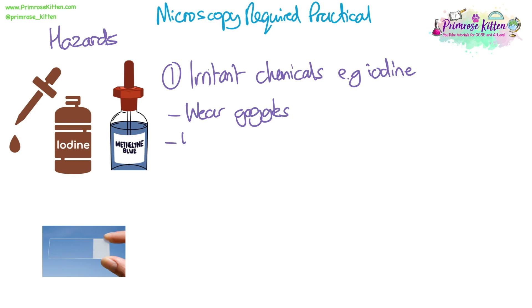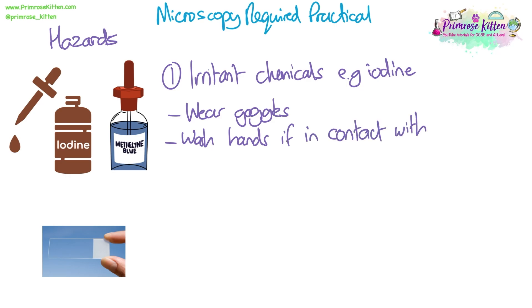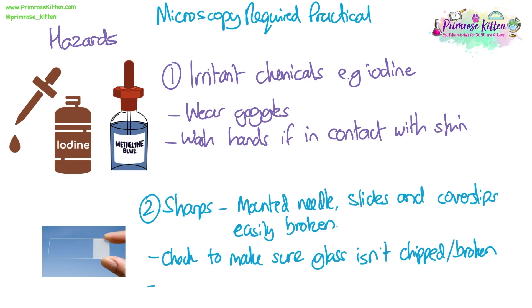If any of these substances gets on your skin at all, you should also wash your hands straight away. Some of the equipment can be considered sharp — we could be using a mounted needle, and the slides and coverslips are glass and can be easily broken or have chipped corners or edges. Please make sure to check that all the glass isn't chipped or broken before you start, and be very careful about putting them near the edges of the bench.